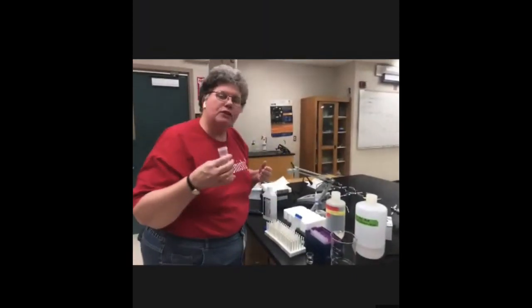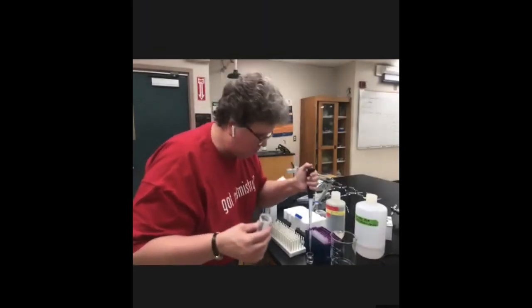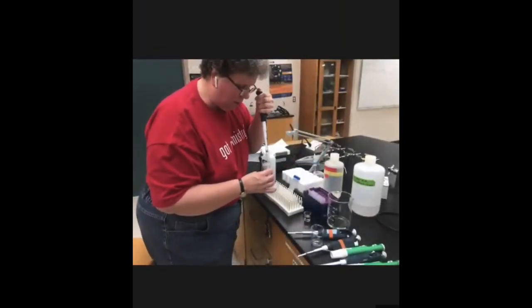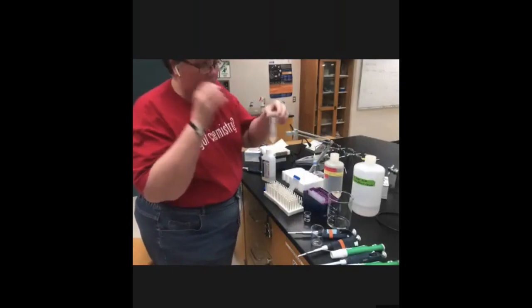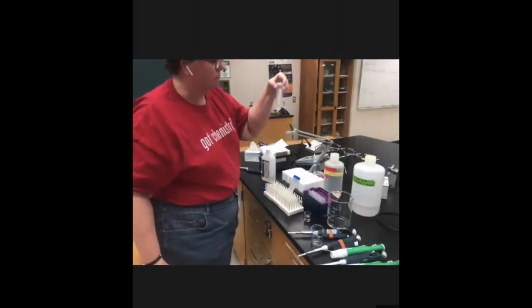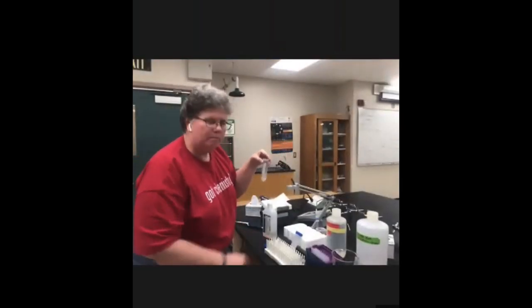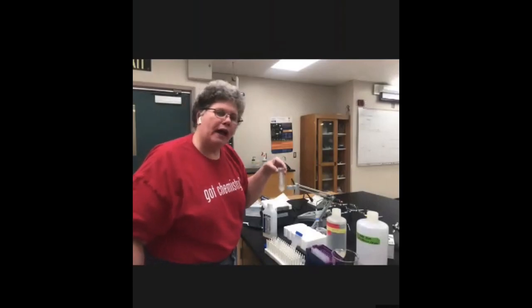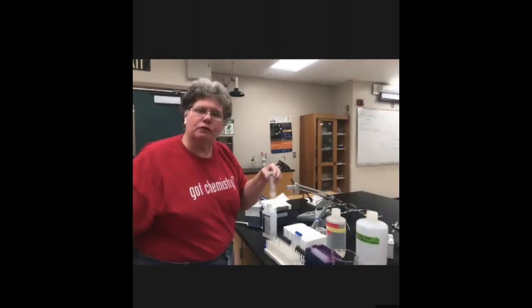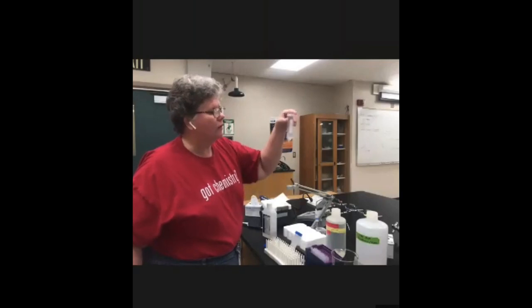So now we need to ethanol precipitate a second time. To do this, we're going to bring our pellet up in water. So we're starting by bringing it up in a half ml of water, swirling it around, letting it dissolve. After it dissolves, we're going to put the half ml into a tube, and then we're going to add another half ml of water to the container, and again, swirl it around. We're trying to make sure that we've got all of the DNA from our container here.